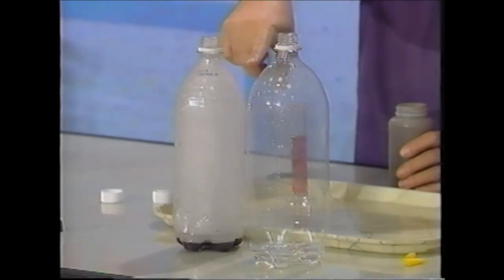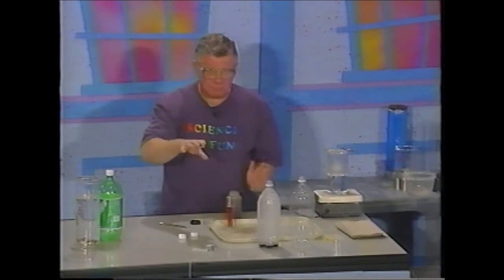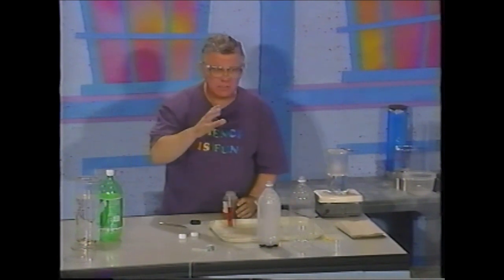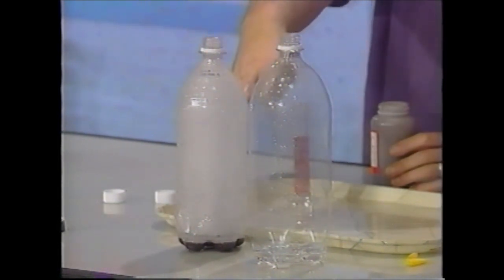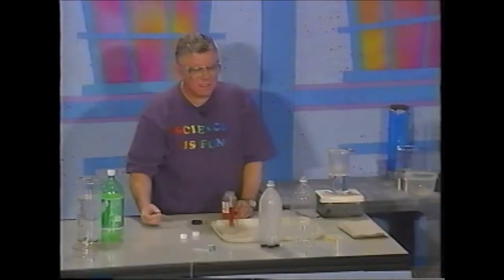What has happened? Well, this is a plastic bottle. You've heard of shrink wrapping, haven't you? That's how it works. You take the plastic that you want to wrap something in, and what do you do to it to make it shrink? You heat it. That's what happened over here. So this is a chemical reaction that released energy in the form of heat and caused the plastic bottle to shrink. What do we always do in science?